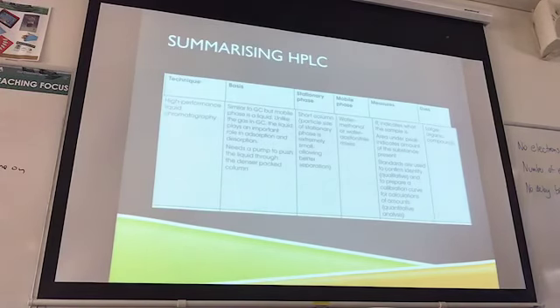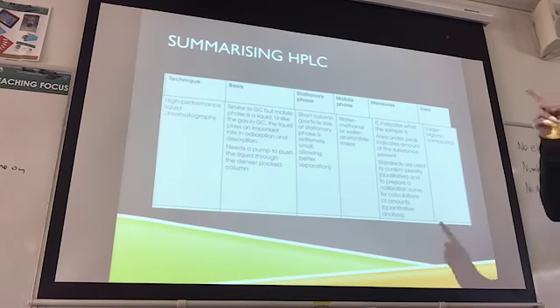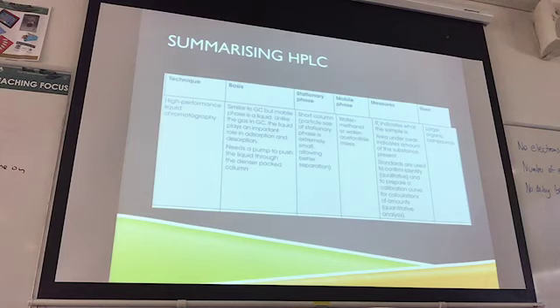So high performance liquid chromatography is similar in idea to gas chromatography, except instead of having gas, you've got a liquid phase as the mobile phase. Difference between the gas and the liquid phase is the liquid phase actually does play a role in the adsorption and desorption rates. So you need to have the appropriate solvent depending upon what sample you're analysing. You need a pump to push it through.